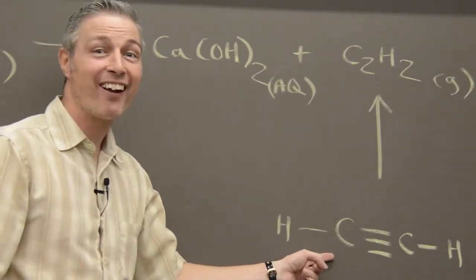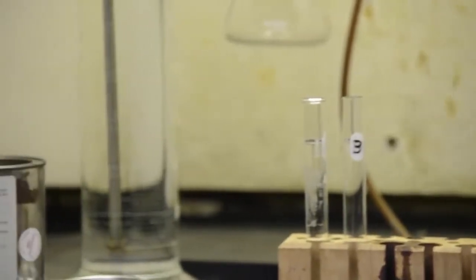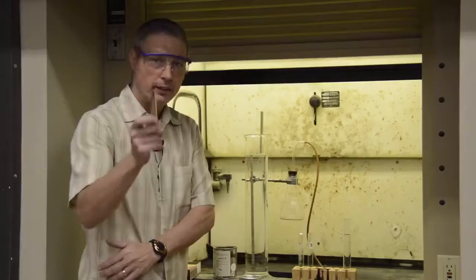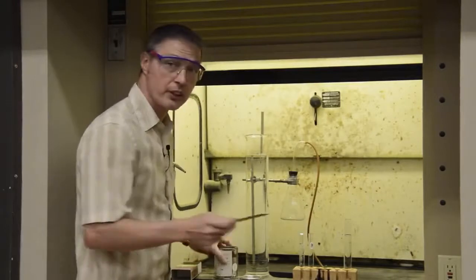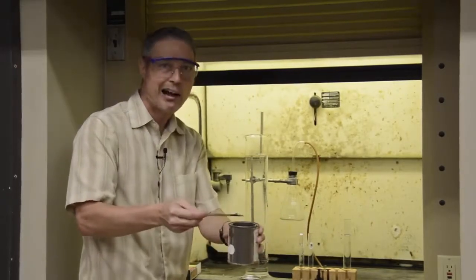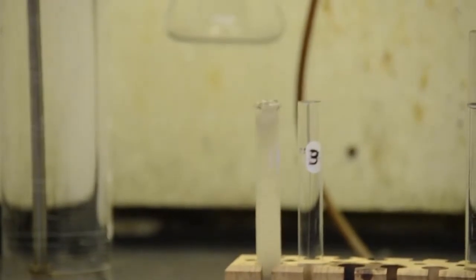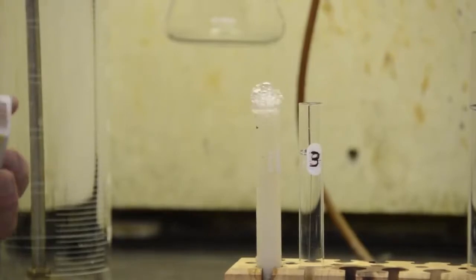Got my safety glasses on. Now we're going to generate some acetylene with calcium carbide. It looks like little rocks. If I take a little bit and put it in this test tube, you'll see that gas is coming out. That's too much gas coming out. Oh well, let's light it anyhow.